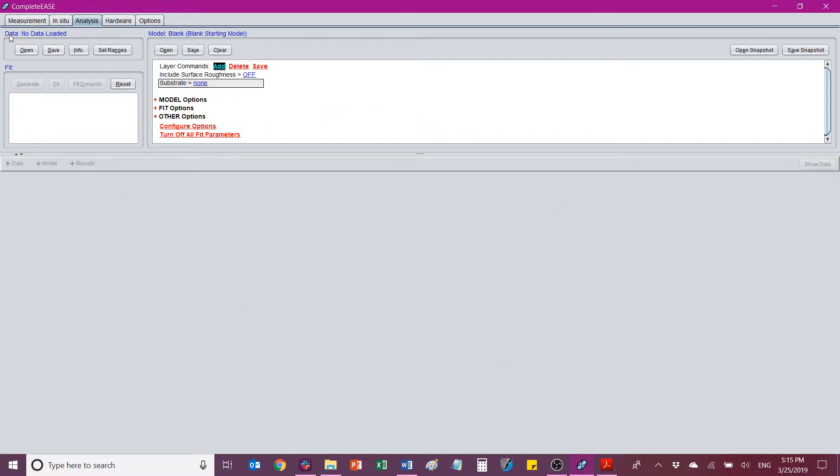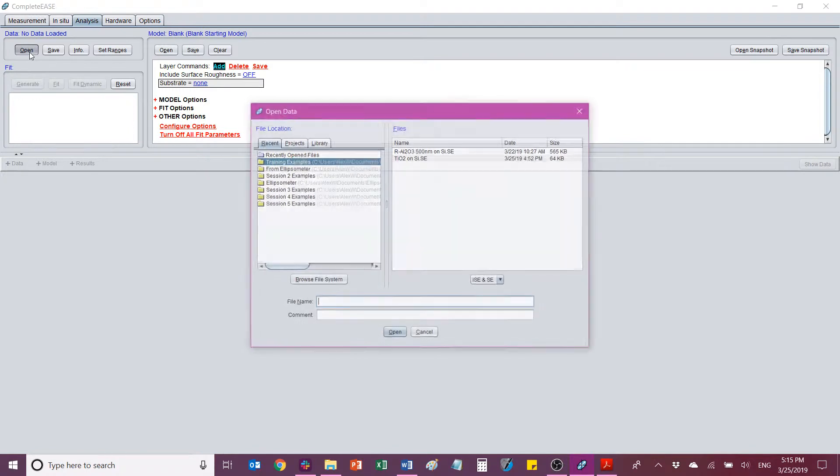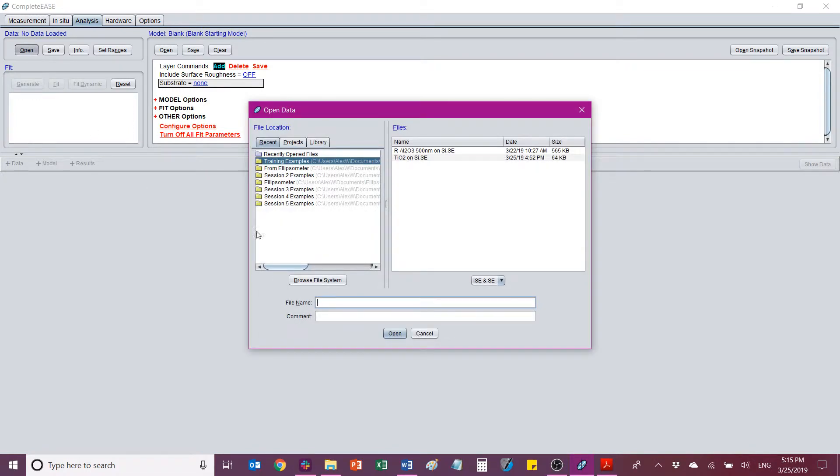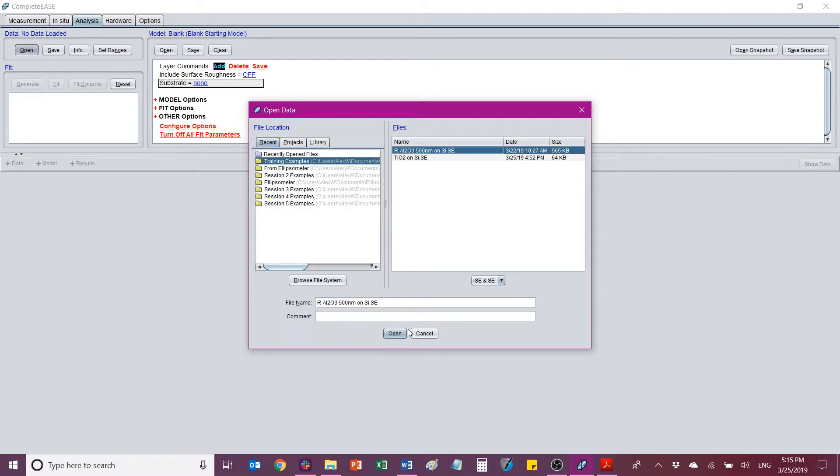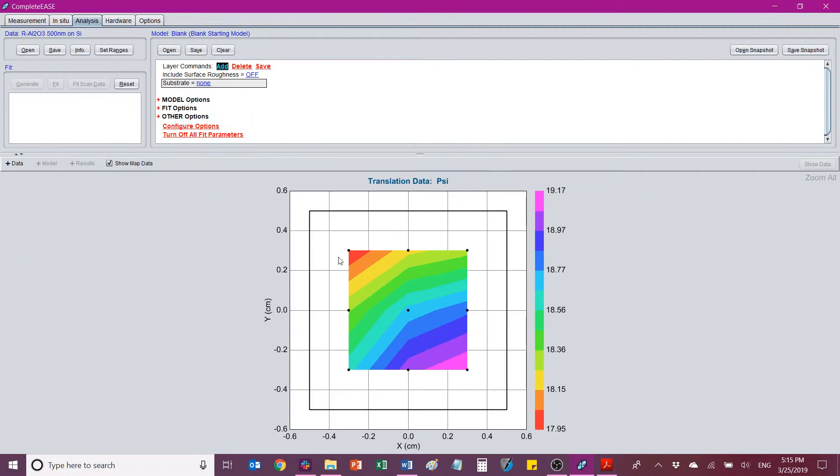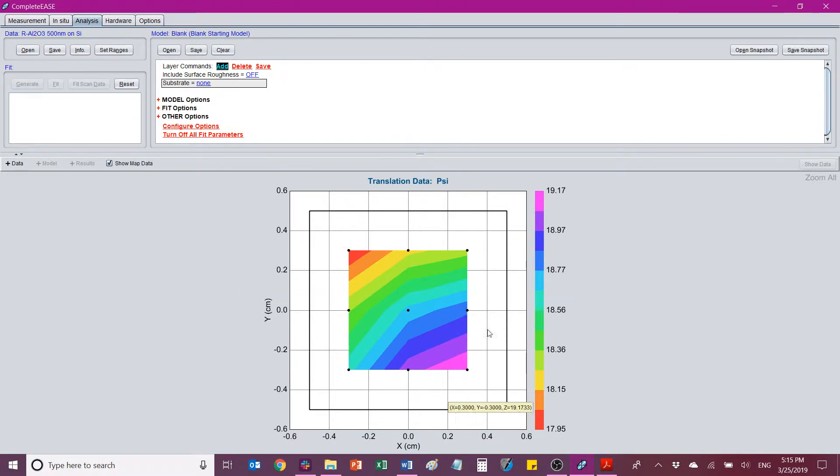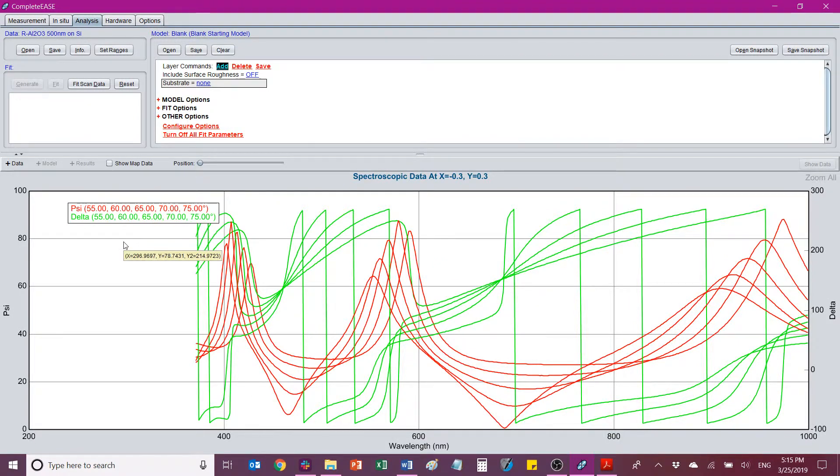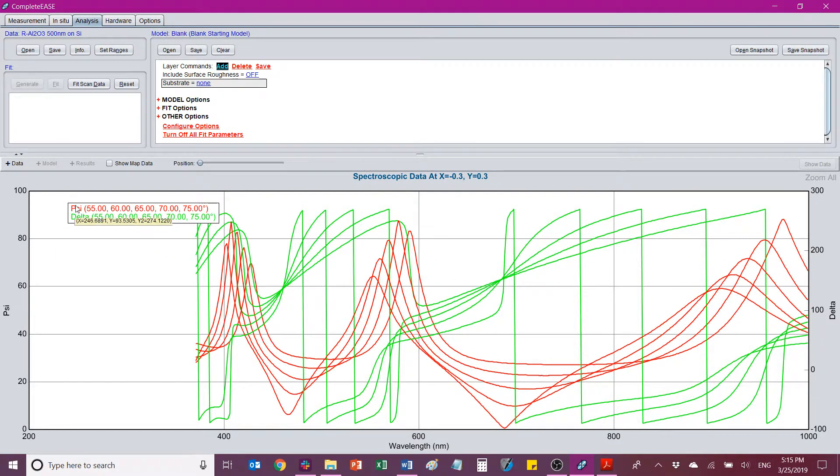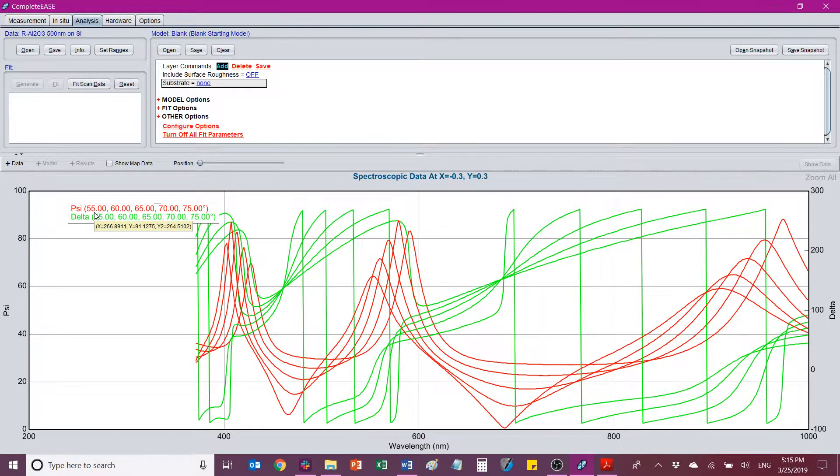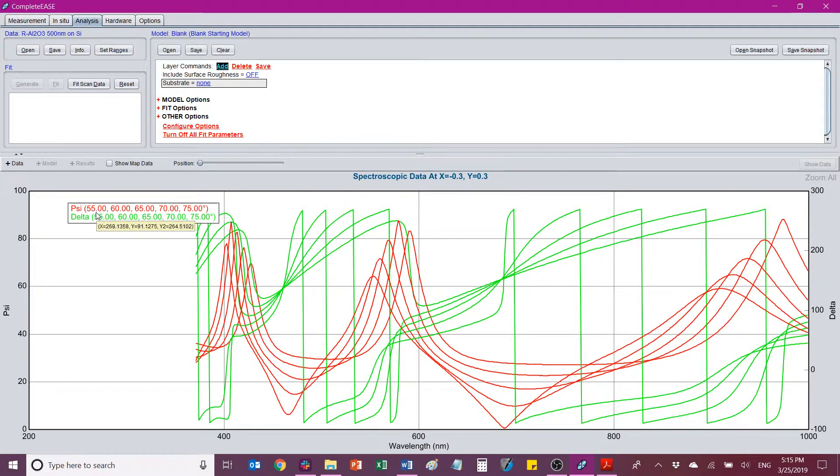The first section we're going to take a look at is this data section right up here. This is where we can open or save a data file. So I'm just going to open it and I'm going to go ahead and open a data file that was collected for reactively sputtered aluminum oxide grown on silicon. So when it comes up, you won't necessarily see this. We'll come back to this in a second. For just right now, I'm going to click this Show Map Data right here. And that will bring us to the raw collected data, which is the psi and delta, which has been collected at a number of different angles of incidence for the source and the detector.